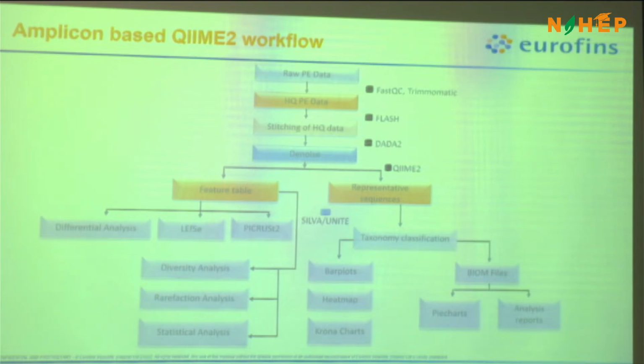Initially, as I said, we extract the DNA. We use a primer sequence with the Illumina adapters in it for capturing the particular region in 16S. Once we have captured that region, it becomes an amplicon, which we index to separate my different samples. We are not running one sample in one run; we are running 70, 80 samples in one run. Each sample has its unique barcode to differentiate it from the other samples, and then we sequence it on next generation sequencing.